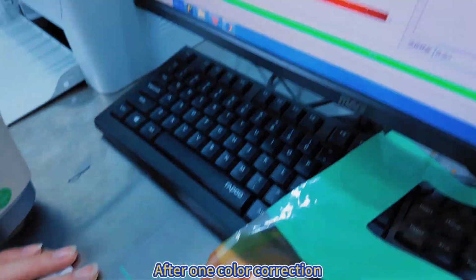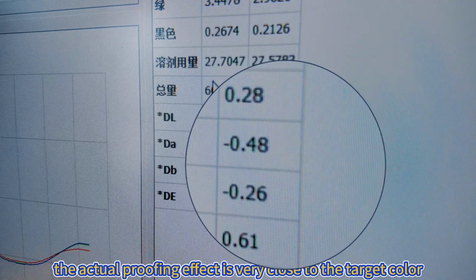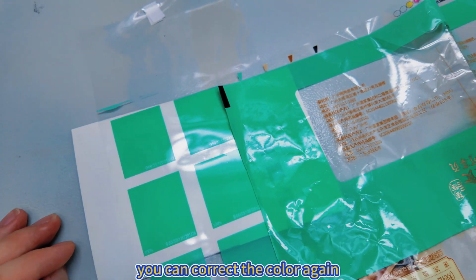After one color correction, the actual proofing effect is very close to the target color. If you have higher requirements for color difference, you can correct the color again.